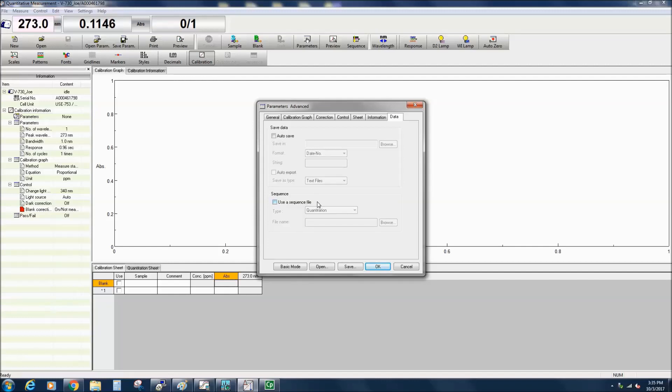If a sequence has previously been set up, you can select the Quantitation or Calibration and Quantitation sequence file here. A sequence performs the baseline, standard, and sample measurements automatically. This operation can be performed by clicking the Sequence tool button in the icon toolbar.